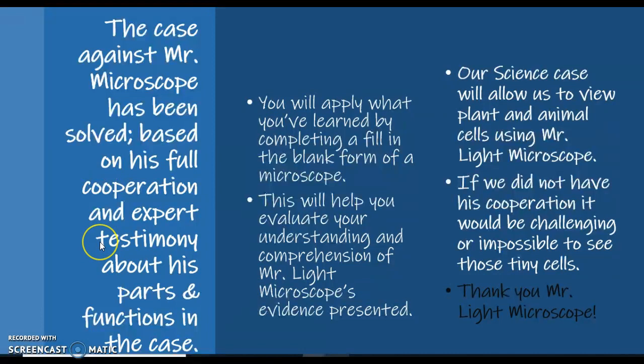You will need to review and re-review the parts of the microscope and their functions. Hint, hint. Once you come to class, you will apply what you learned by completing a fill-in-the-blank form of a microscope. And this will help you evaluate your understanding and comprehension of Mr. Light Microscope's evidence that he presented when we interrogated him.